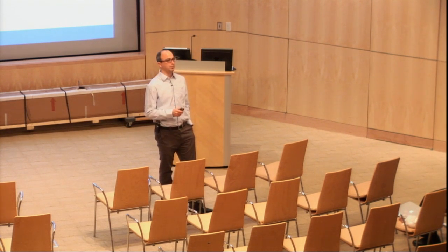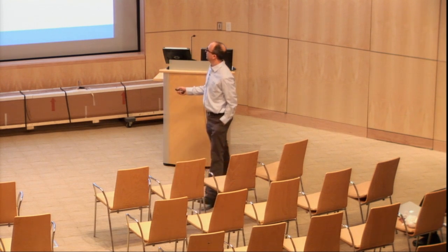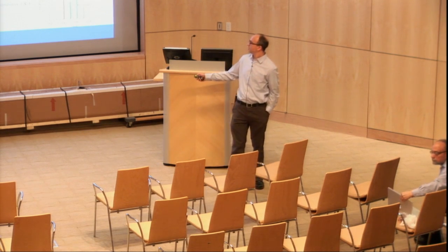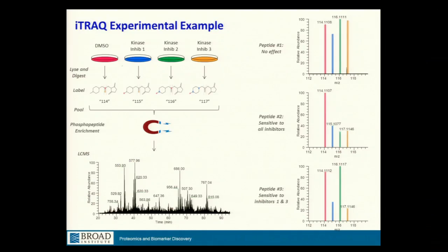So that's a little tricky because remember, in a phosphoproteome experiment, a lot of what we do involves a phosphopeptide enrichment step. So in a straight phosphoproteomics experiment, the bulk of the peptides that we measure are phosphopeptides. And in that case, the quantification that we report is at the site level, especially given the caveat of how well we've localized that site.